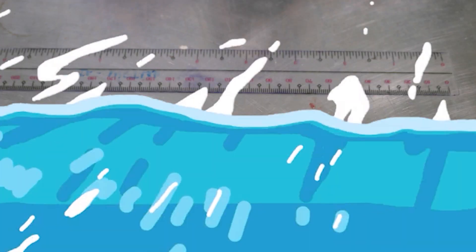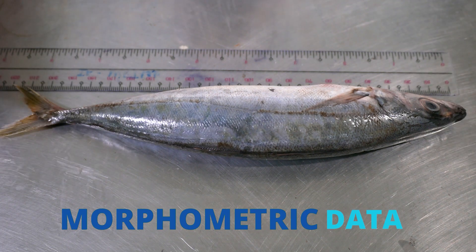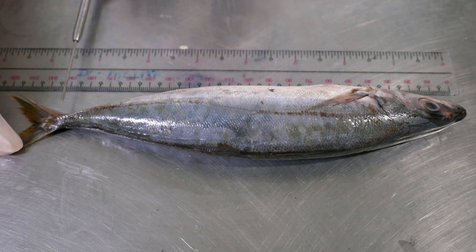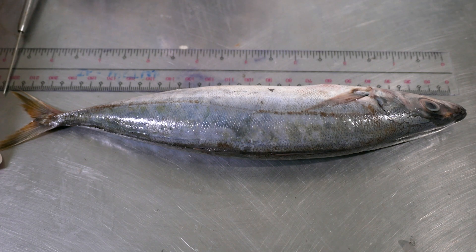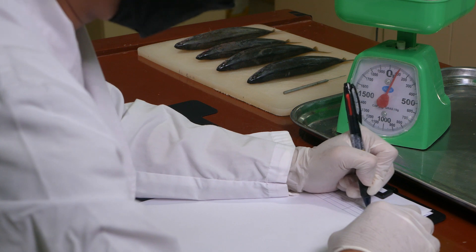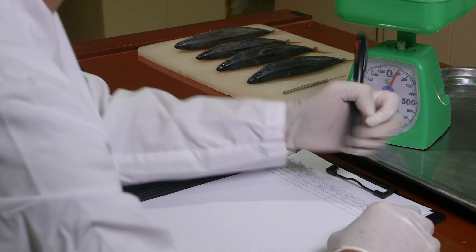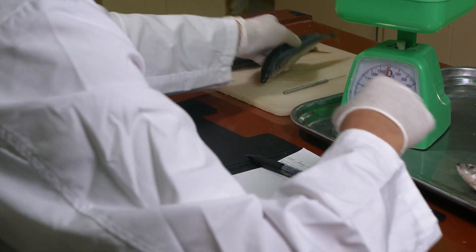We'll start by taking note of the morphometric data from the fish, such as its standard length in centimeters, total length, and total weight in grams. Write these details in your lab notebook. Take note also of the fish species and, if possible, the estimated age of the fish.